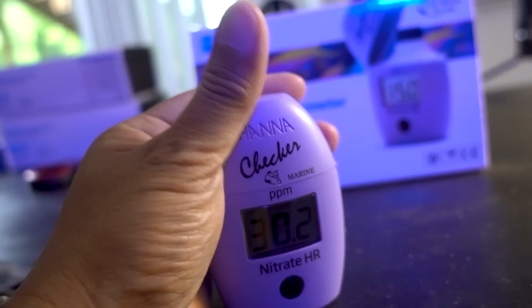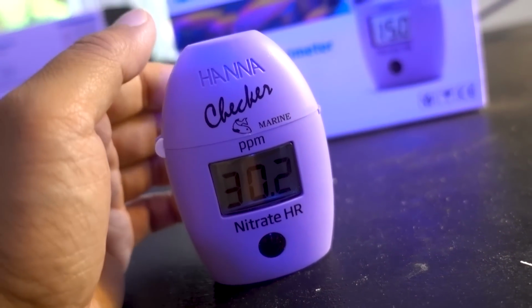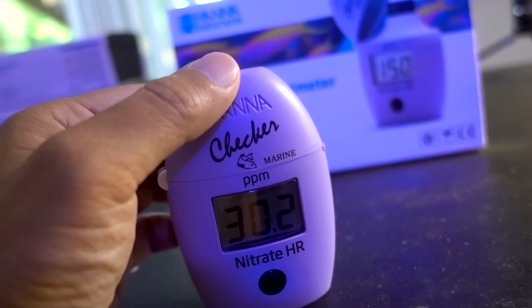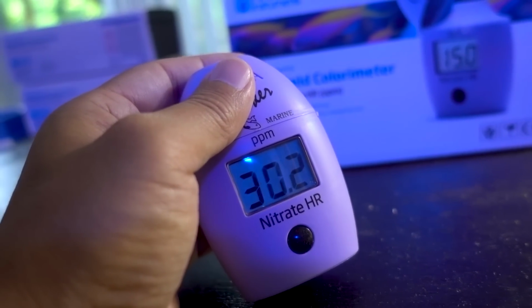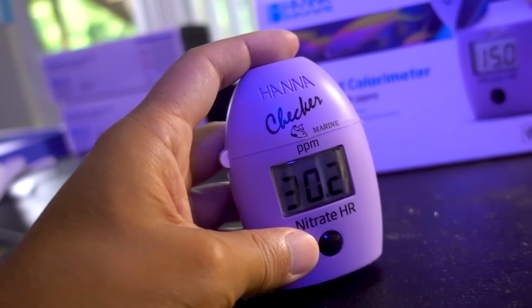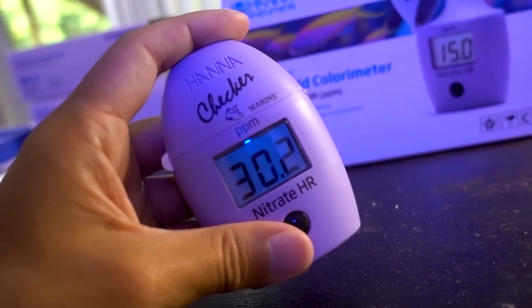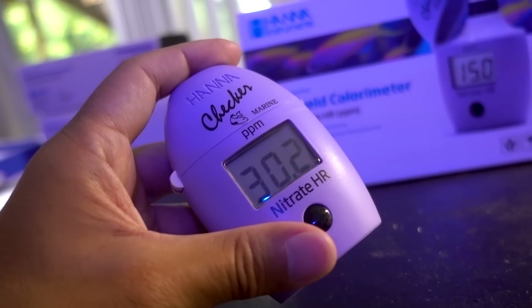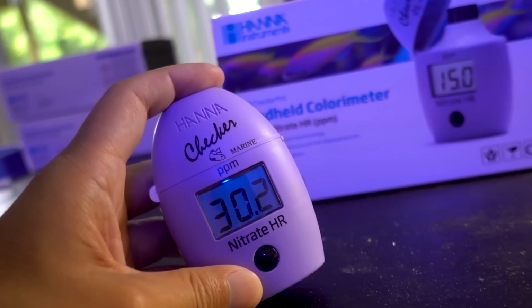If I have to pick 3 of my most favorite Hanna checkers right now, it's going to be alkalinity, phosphate, and also the nitrate high range. The other ones, like the low range, are a little bit too many steps. I also bought the silicate one, which my tank was immediately out of range for, so that did not help me too much in terms of water testing. I think these 3 are the trinity for Hanna checkers right now. Now, it seems a bold claim, seeing how I've only used this once, but it is a pretty straightforward process.